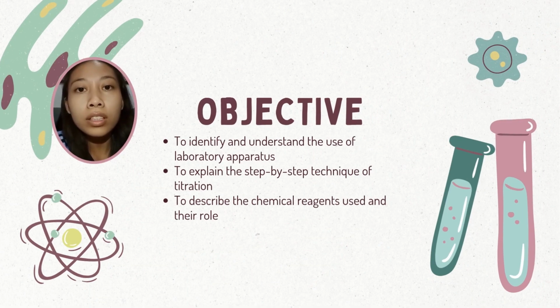We are able to identify and understand the use of laboratory apparatus. Second, we are able to explain the step-by-step technique of titration. Third, we are able to describe the chemical reagents used and their roles.